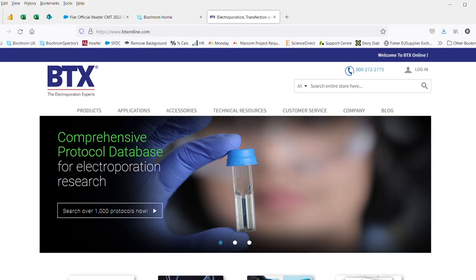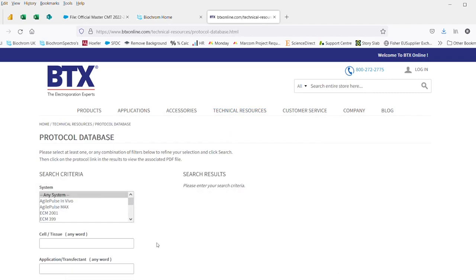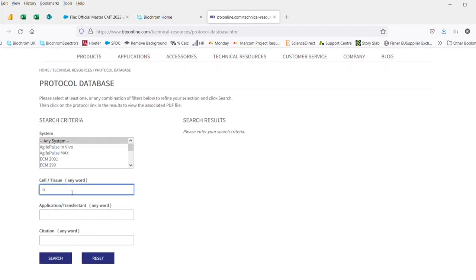The electroporation instruments from BTX are incredibly easy to use. The best starting point is BTXonline.com, where there is a comprehensive protocol database. Searching by cell type and being as specific as you can will usually give you a selection of application notes, which make a great starting point.